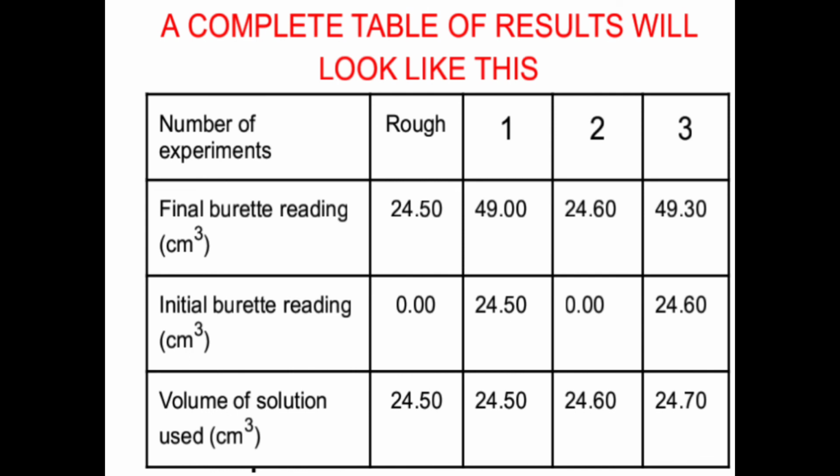There is the 0.50, there is the 0.00, and there is also 0.50. When you look at column 1 or experiment 1, we are having 0.00, we are having 0.50, and also 0.50. So which means our results there, they are having 2 decimal places. So it means our table in that concept, it is correct.